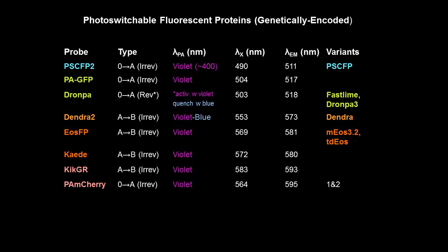I've used that recently, and it works really great. It's bright. It's a monomeric protein. Originally, the protein was actually a tandem dimer. It was huge, and it was hard to actually transfect in and be stable. And apart from that, the other one to use is Dendra.